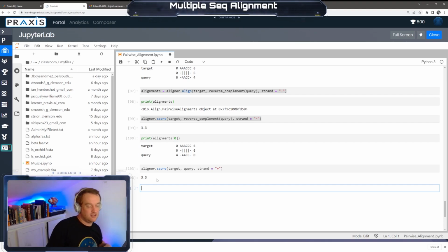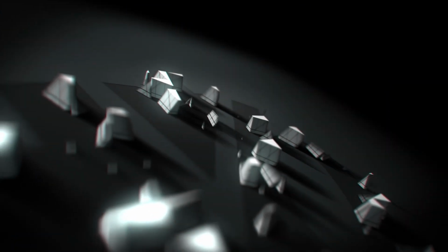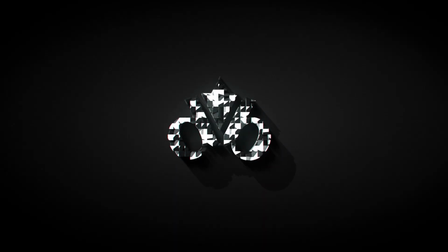So it depends if you're using cDNA or RNA or some of these different versions of the same DNA, say different transcripts of the same DNA. Then you can manipulate this pairwise alignment to better suit your needs in that regard. So there's a lot of pairwise alignment stuff. We cut out MUSCLE because it just involved too much installing of packages.